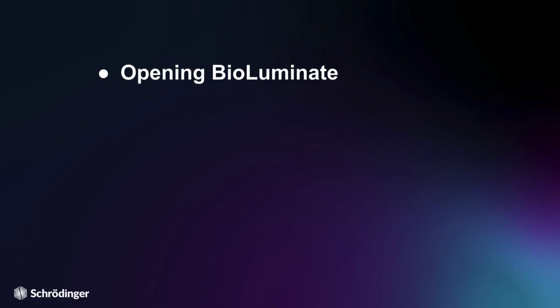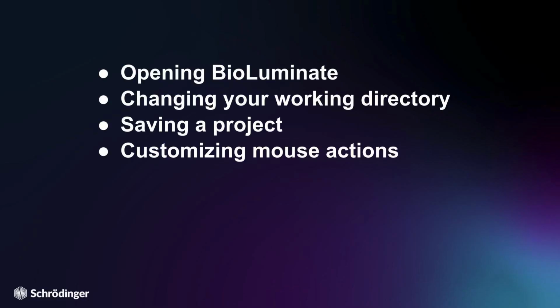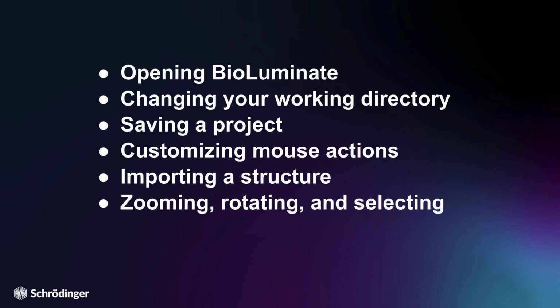Hello, and welcome to our video introducing you to the BioLuminate interface. After this video, you should know how to open BioLuminate, change your working directory, save a project, and customize your mouse actions. You will also be able to import a structure into the workspace, as well as zoom, rotate, and select a structure. Let's get started.